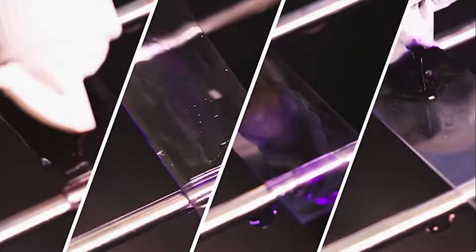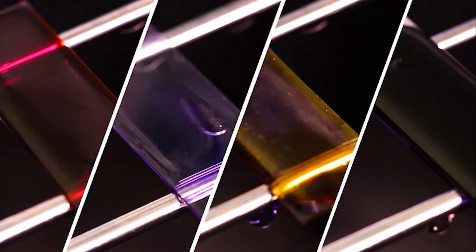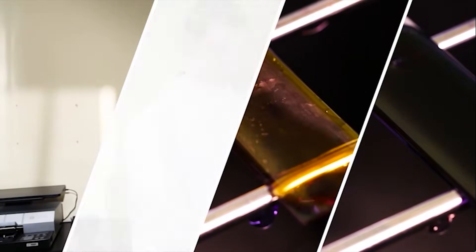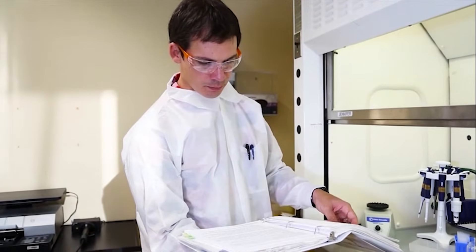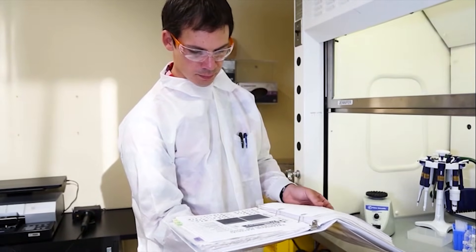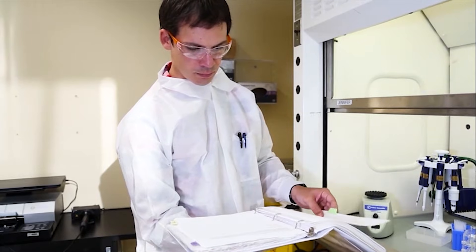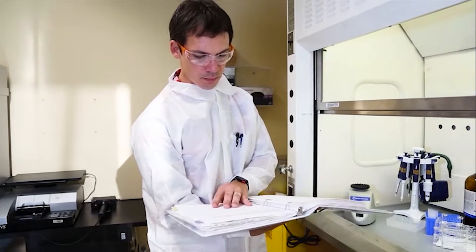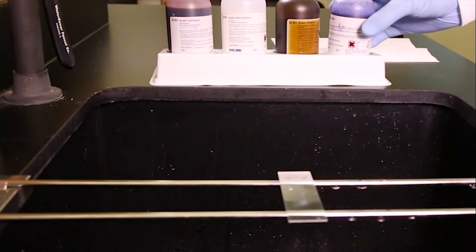There are variations of the Gram stain procedure regarding the timing and reagents, but the basic steps are the same. You will need to follow your institution's procedures. For this Gram stain demonstration, we are going to follow the American Society of Microbiology's Manual of Clinical Microbiology Procedures, 10th Edition. Position your slide rack over the sink and place the fixed slide on the slide rack.